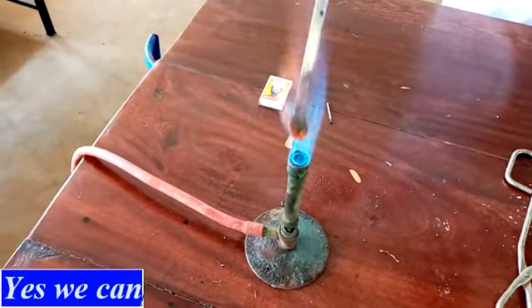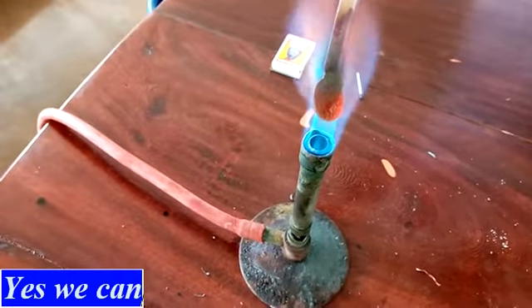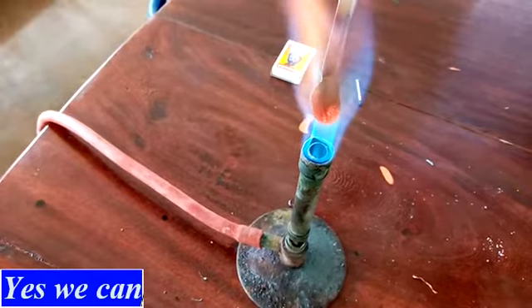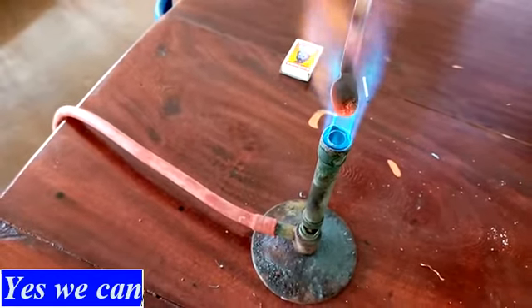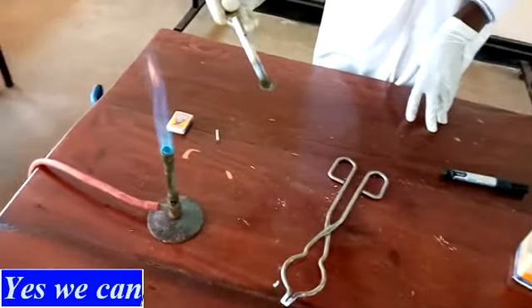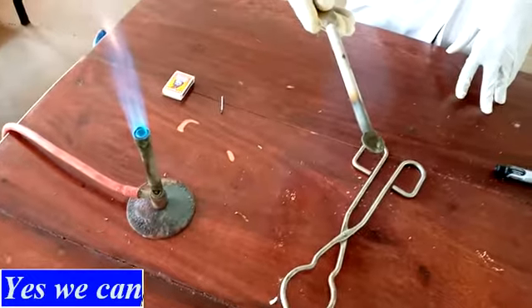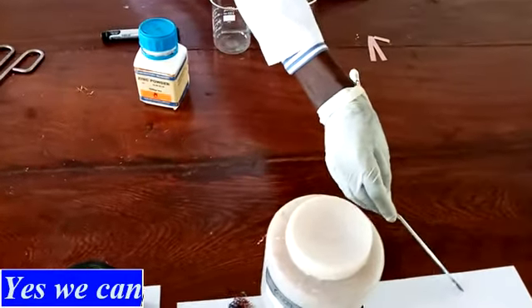That's why I'm leaving it there, so that you can see when it is hot, what is the color, and what is the color when it is cold. Let's leave it to cool, and we see the color of the product.